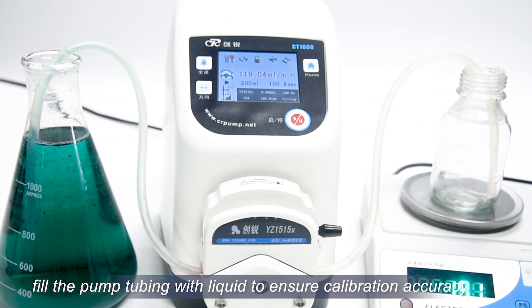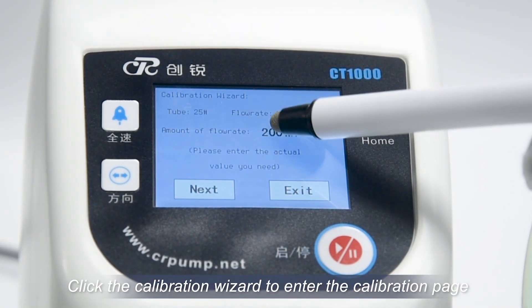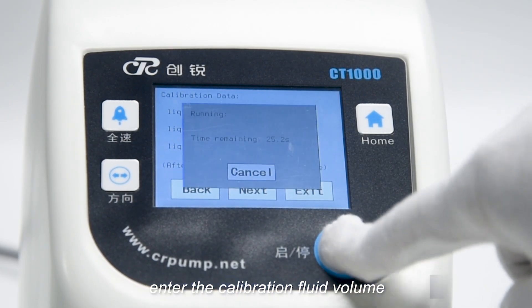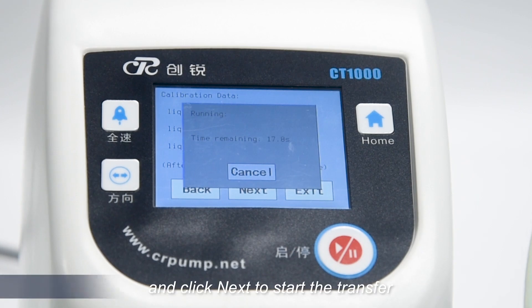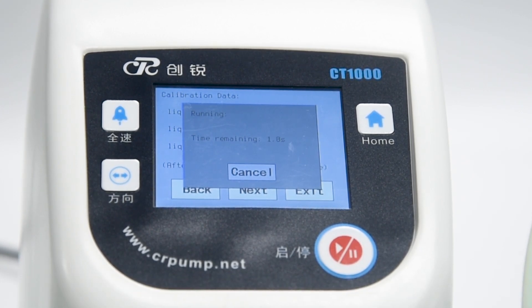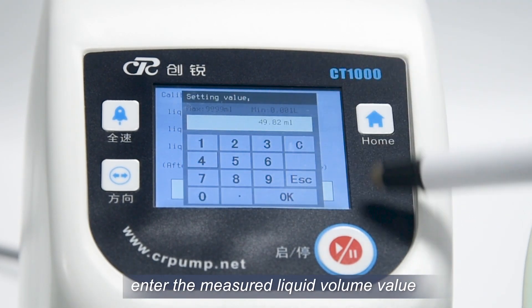Before starting calibration, fill the pump tubing with liquid to ensure calibration accuracy. Click the calibration wizard to enter the calibration page. Enter the calibration fluid volume and click next to start the transfer. After the transmission is completed, enter the measured liquid volume value.